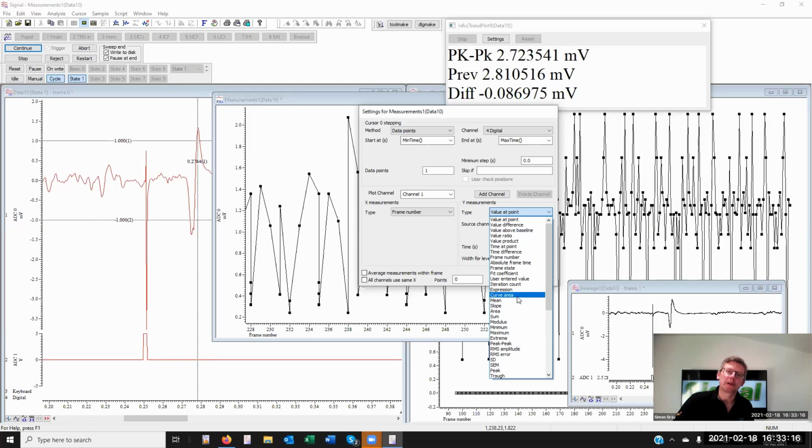I've mentioned the different types of area measurement before. So we have modulus, curve area, and area, the slope, etc. Now, that could be the slope between 2 cursors, where we found a 20 and 80% repolarization, and we will look at that in a few moments again. Right, so peak, troughs, values, etc.